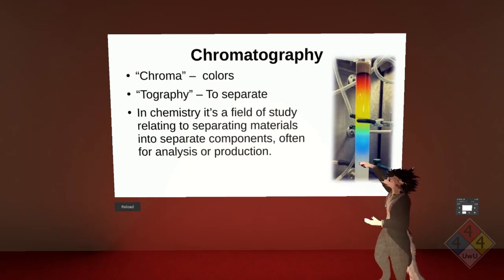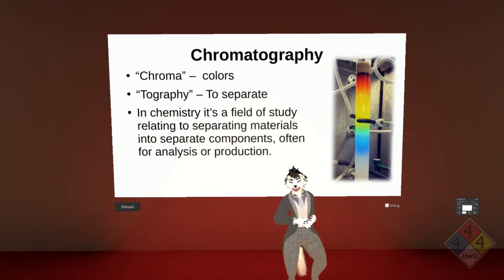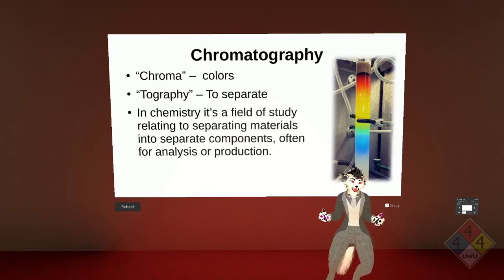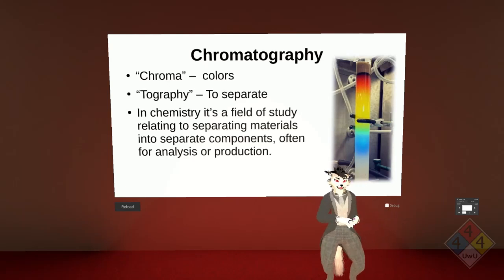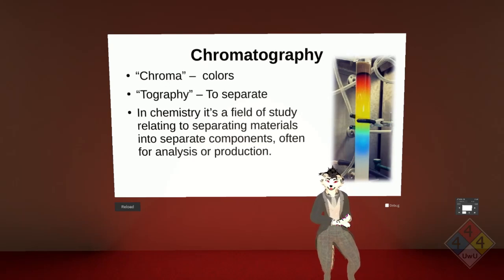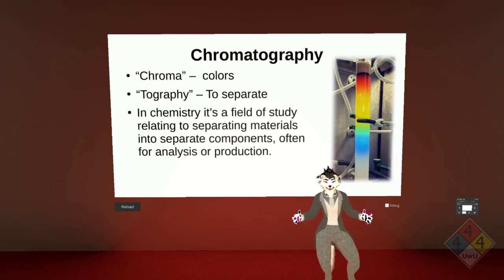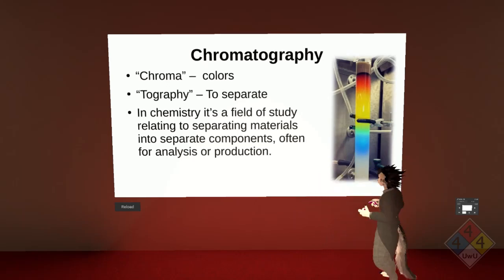So in chemistry, in either production or analysis, you have to figure out what's in it and then separate them by, let's say, boiling point, polarity, size exclusion affinity, or something of the sort. There are different ways to perform chromatography, but that's the underlying theory underpinning modern chemical analysis, and in this case, molecular biology as well.